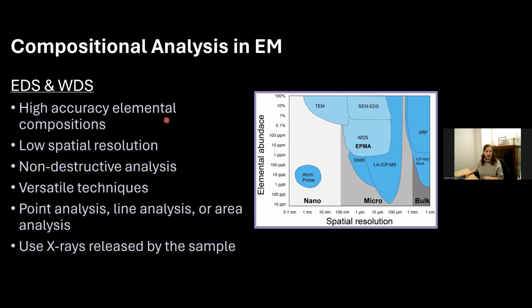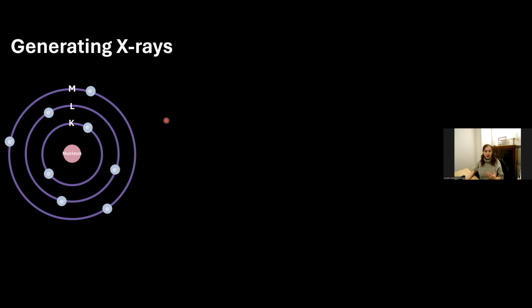It's really versatile, and there's so much you can do with it. You can do it as just single point IDs, but also across areas, which makes it really useful, especially because you can define where those areas are.